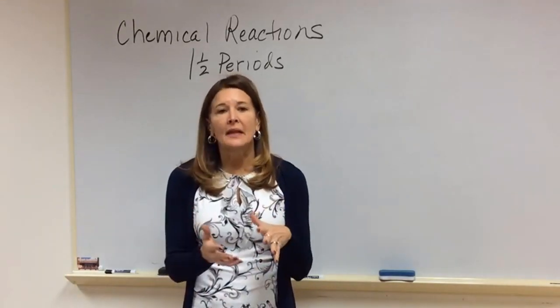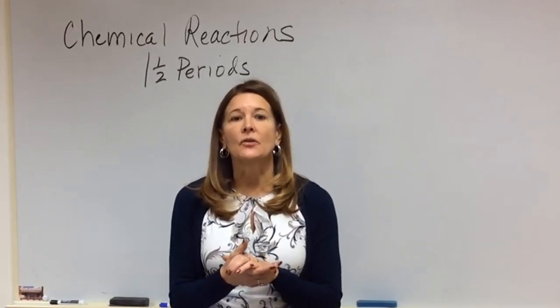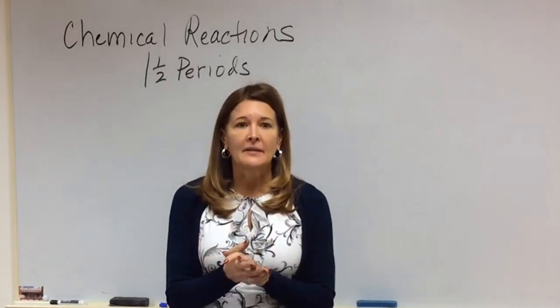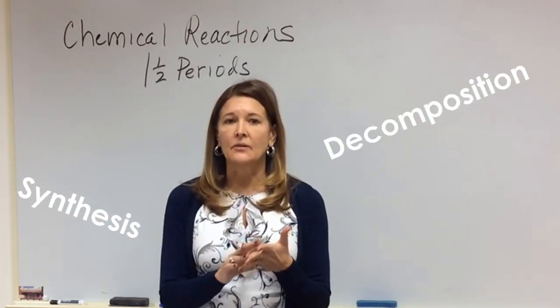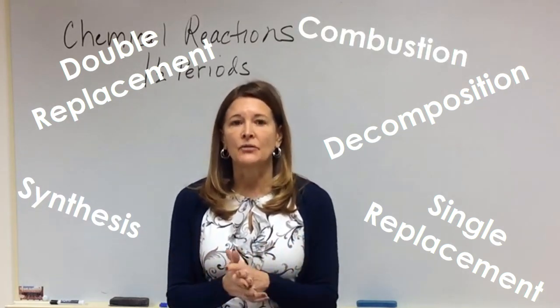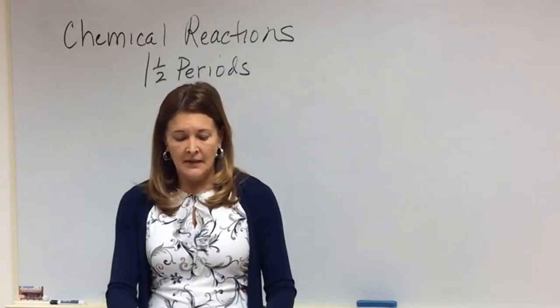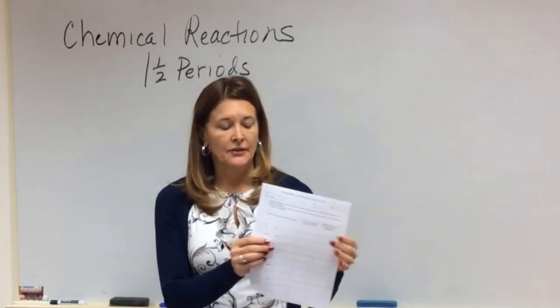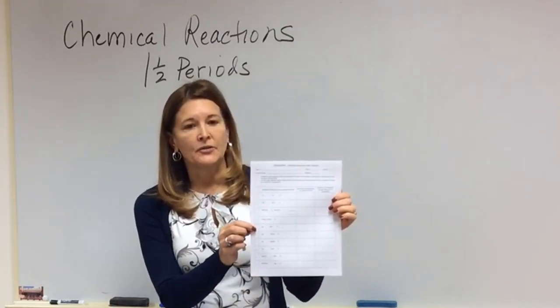The purpose of this lab is for you to see a variety of chemical reactions. In lecture, you've learned about the 5 main types of chemical reactions. There's synthesis, decomposition, single replacement, double replacement, and combustion. So this lab will give you some exposure into some of those various types of reactions. Now, if we look at this page here, that is labeled the results page.